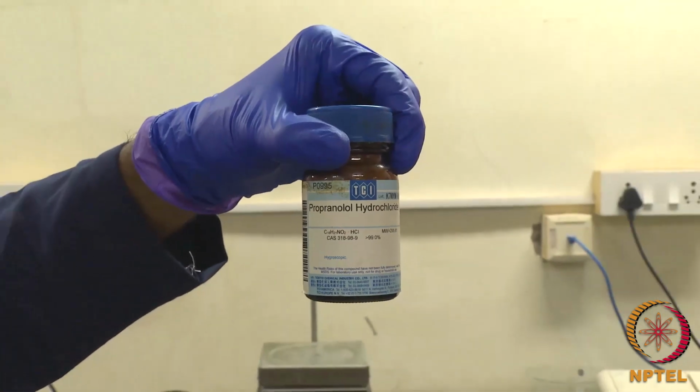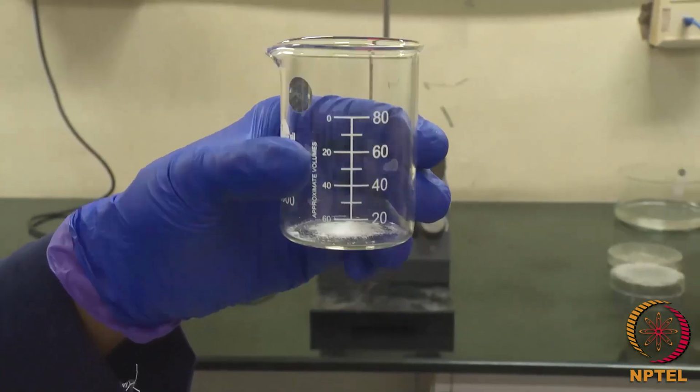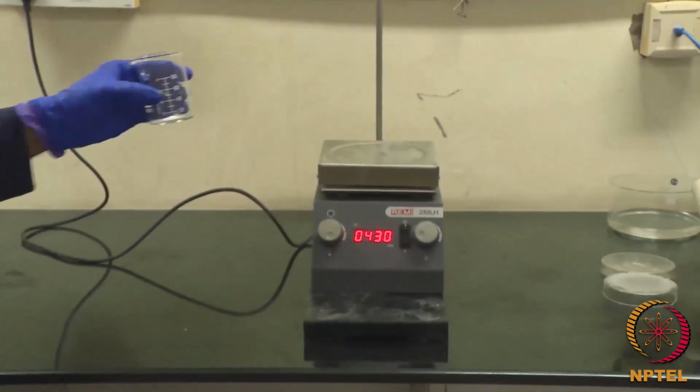Weigh 150 milligrams of drug propranolol and dissolve it in 1 milliliter of dichloromethane and methanol.